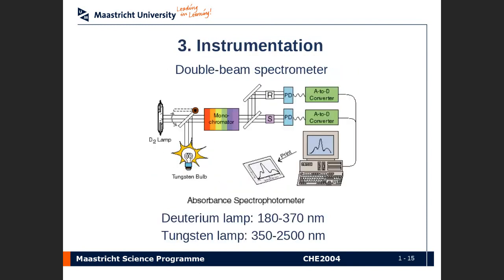So essentially what it does is it passes through a monochromator, you scan wavelengths, you'll typically start at a high value, 2500, and it will scan to lower and lower values, and while it's doing the scan, you can see if there's an absorption or not at a specific wavelength. So it's actually quite a straightforward technique.